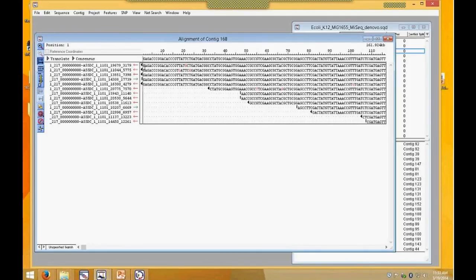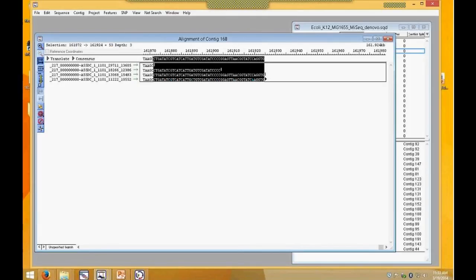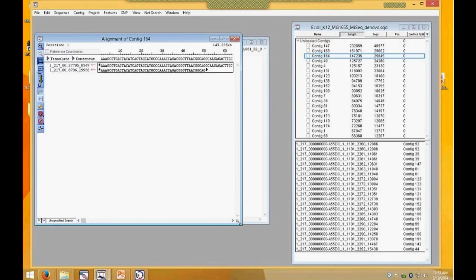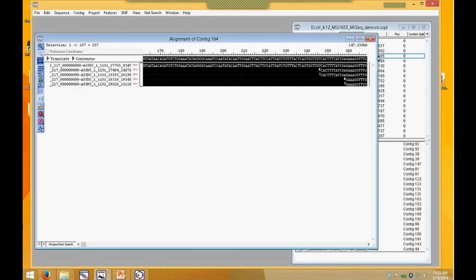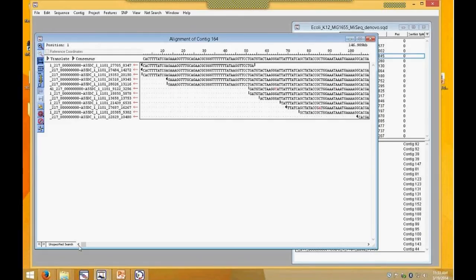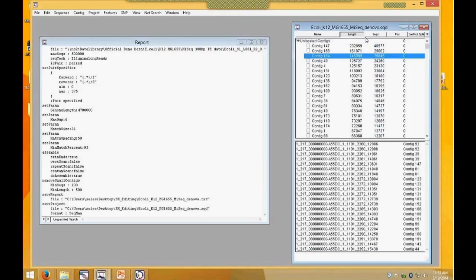It's not necessarily one sequence at a time, but I might highlight a group of them, and I call them the toenails, and trim those off like that. Now, what I just trimmed, I probably wouldn't have done that because I don't see mismatch. Well, here's one that is, okay, here's one where it's a thinner area. Sometimes you see this kind of thin extension, and sometimes that is actually a chimeric read, and I'd like to trim those. Okay, so that's another way to edit contigs.